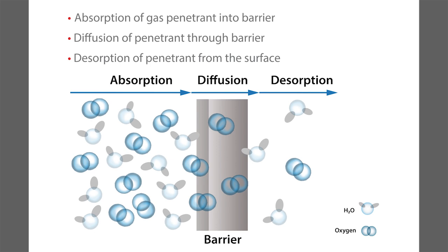Think of a structure that might be like a foil pouch. You may have a great foil layer here, and then a polyethylene layer that helps you heat seal and bond the pouch together. Maybe there'd be another layer outside the foil. So this would be a high barrier material. If we're going to run the sample, people think, oh, you're just going to see nothing coming out of this. But the reality is that this material is out in ambient air, and the polymer and film materials we're looking at absorb oxygen, water vapor, these gases just from ambient. They're kind of like a sponge.